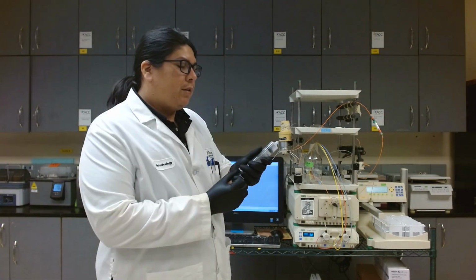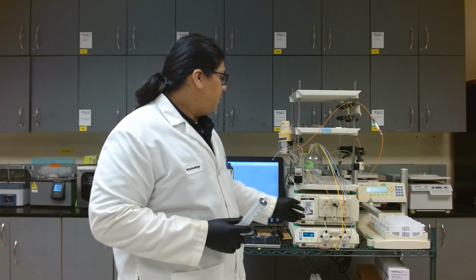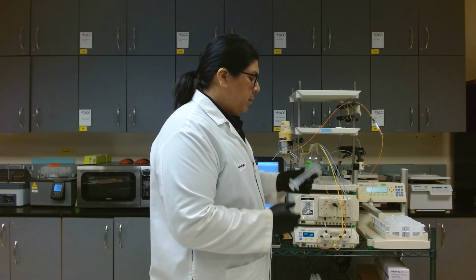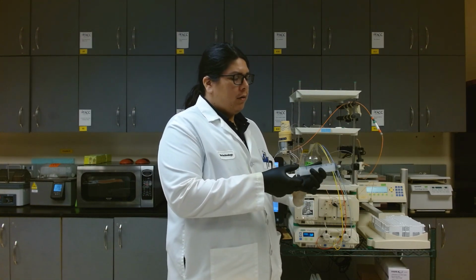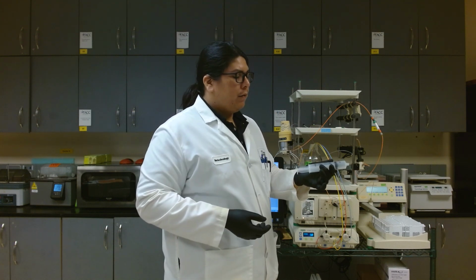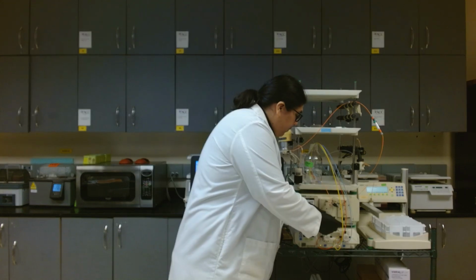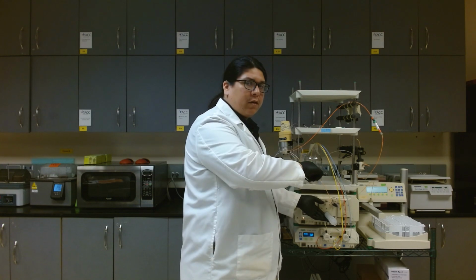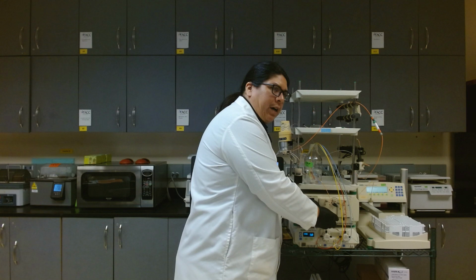All right, so I'll prime the system, and to do that, I'm going to take a 60 milliliter syringe, and at the front of each pump there's a priming port. So I'm going to place the barrel of the syringe onto the port, and then I'm going to open the port, and I'm going to slowly draw 10 to 20 milliliters of my mobile phase through the syringe. You may get some air bubbles trapped in the inlet lines when you switch over between bottles, so that's another reason we want to prime. But once you draw the air bubbles out, you shouldn't see any more.